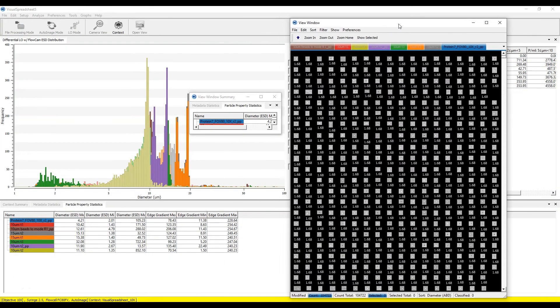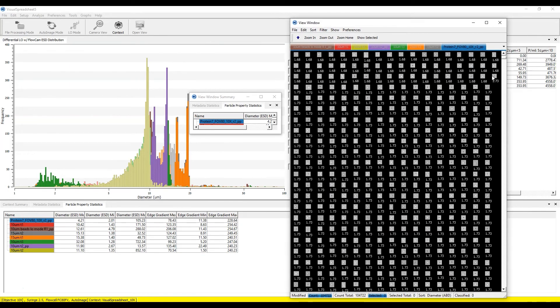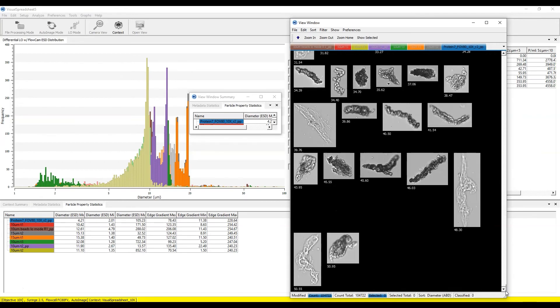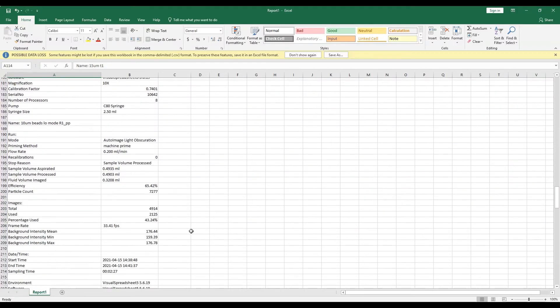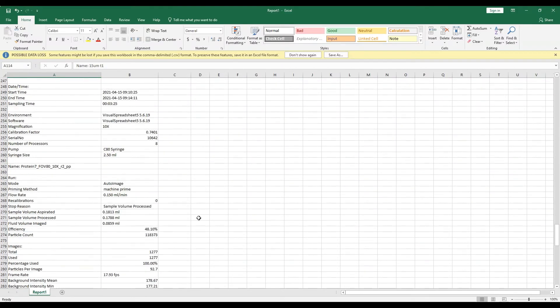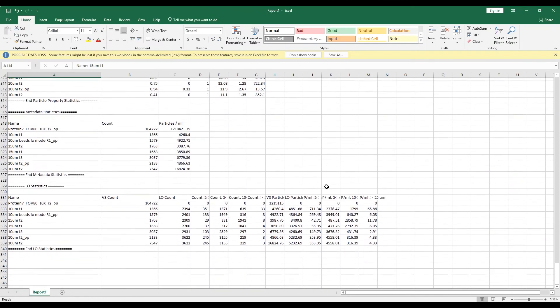And the FlowCam LO's intuitive software, Visual Spreadsheet 5, allows for all data collected in a single or multiple runs to be exported as one comprehensive report, saving you even more time and resources.